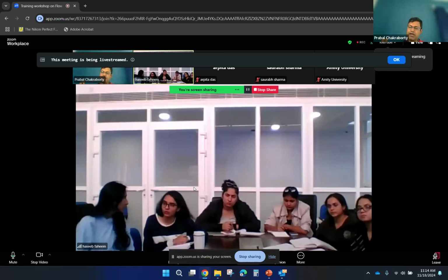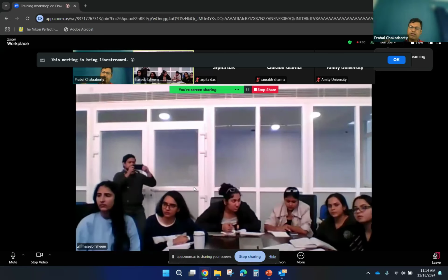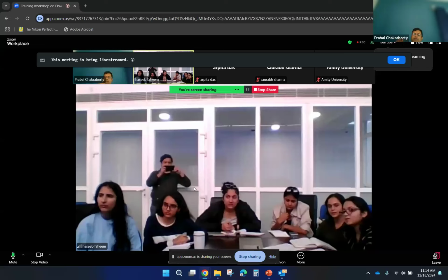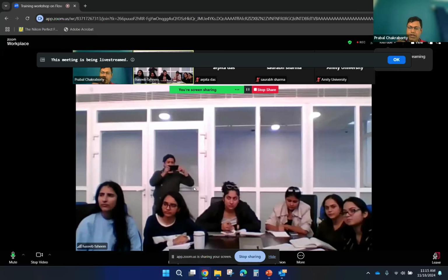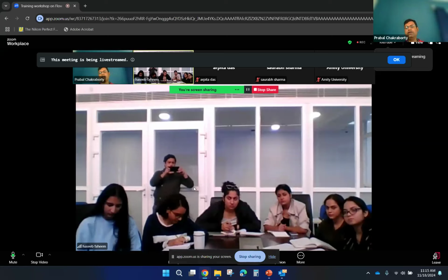Okay, and there are some other small molecules. Probably you have heard about actin fibers, actin microtubule. Okay, so for actin fibers, there is a small molecule called phalloidin. Phalloidin binds specifically to actin fibers. If you put it inside a cell, it will go inside the cell and bind specifically to the actin fibers, no other molecules.